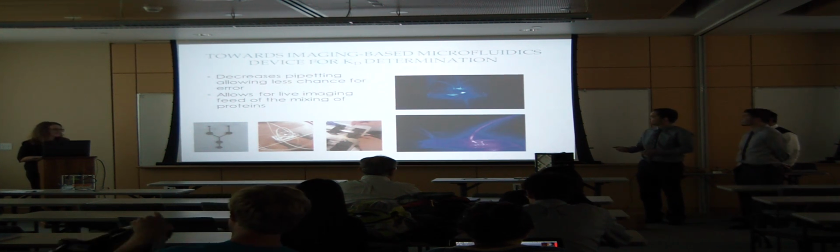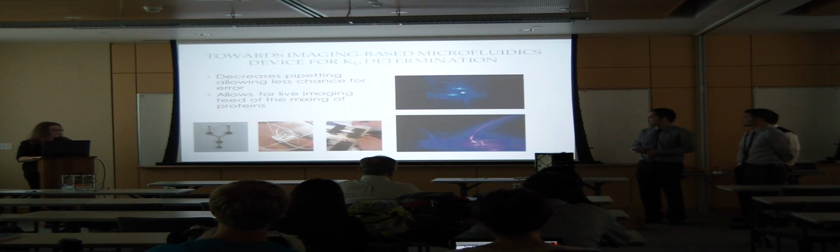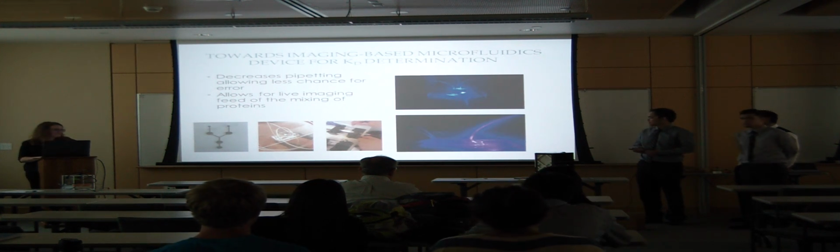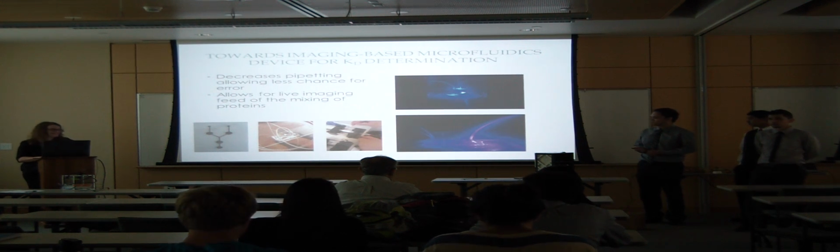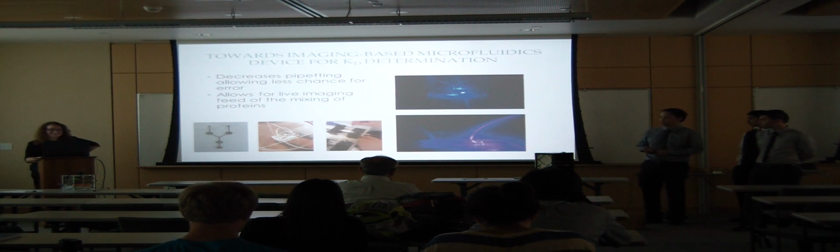And these 2 figures over here were just us testing the microfluidic chip in our imaging device. Although we made around 50 or so of these chips, all of them are still kind of weak. So this is definitely something we want to work on in the future.